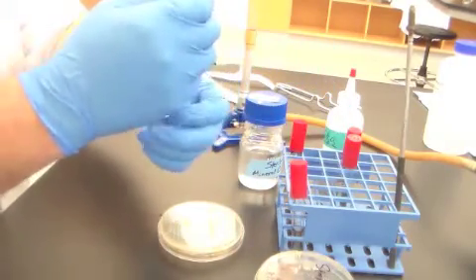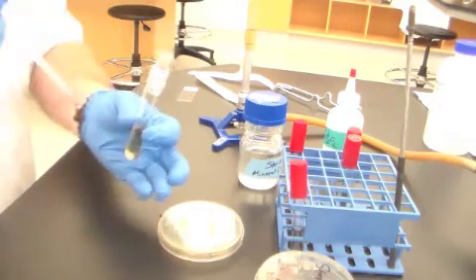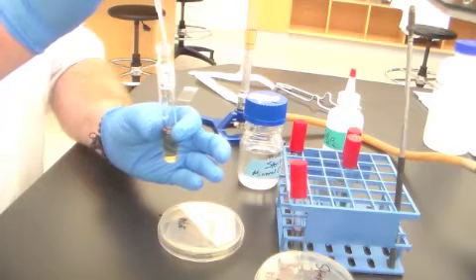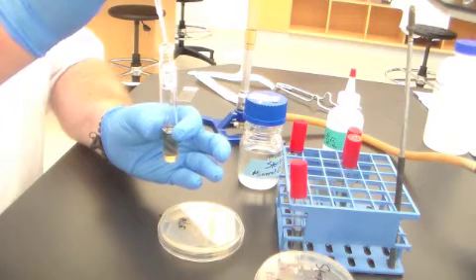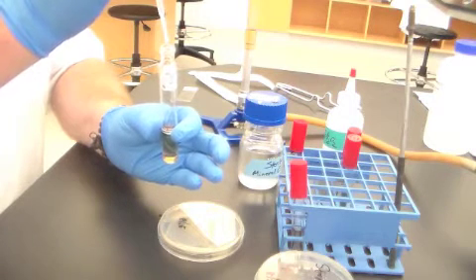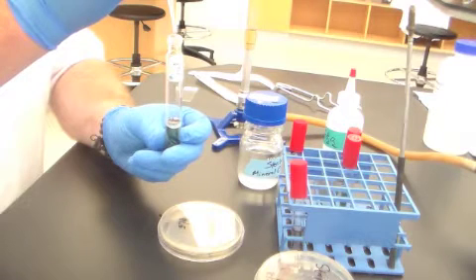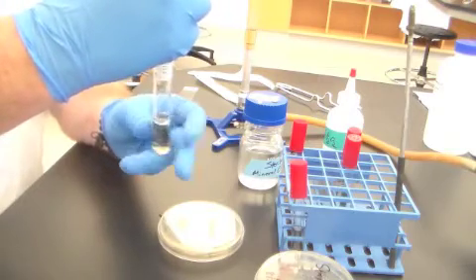Then, into each one of these already inoculated media, so that's another important point. You don't want to put the mineral oil on before you do the inoculation of the bacteria. And you also don't want to touch the glass portion of the tube. That way you can use this same transfer pipette to put mineral oil on all of your cultures. If I were to touch this to the lip, I would worry that perhaps I had contaminated. So what you want to do is put just, you'll notice that the mineral oil doesn't mix with the water, it stays on the top. You want to put maybe close to 1 centimeter of mineral oil.